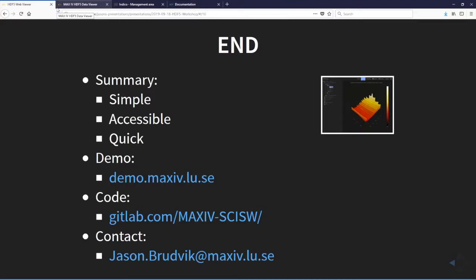So this is an HDF5 file. It's data that has been acquired on ID1 and analyzed by the PyNX library. It's diffraction imaging data. I just open it, and I get something displayed thanks to the Nexus default things leading to a default plot.